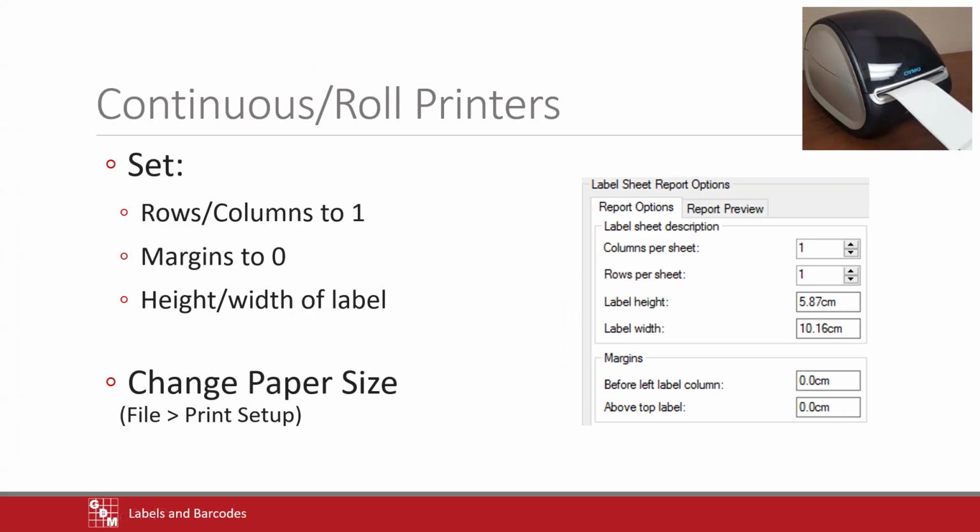And then we'll just have a document that has a lot of pages to it. That's really a way to make ARM work with these printer types. So you would still specify your height and your width like always. Margins maybe would be 0. It might depend on the formatting of that label. But the biggest thing is really pretend that the page size is one label.